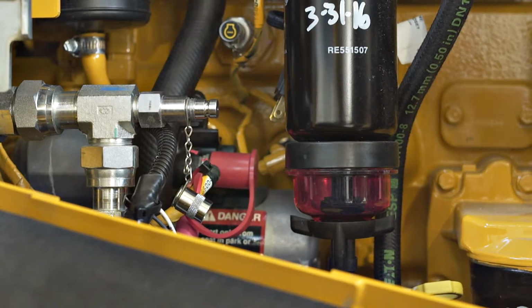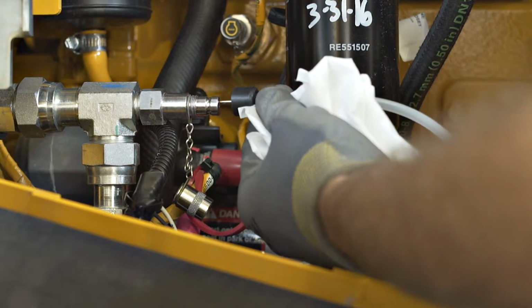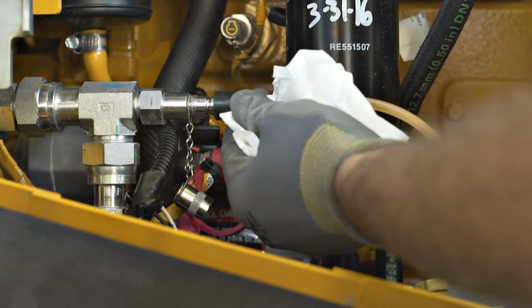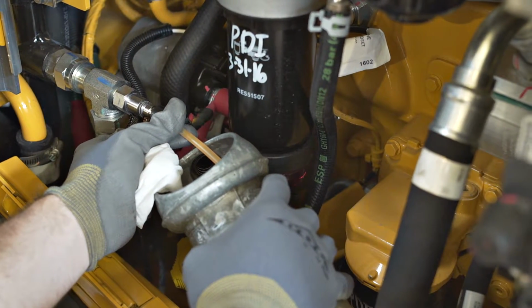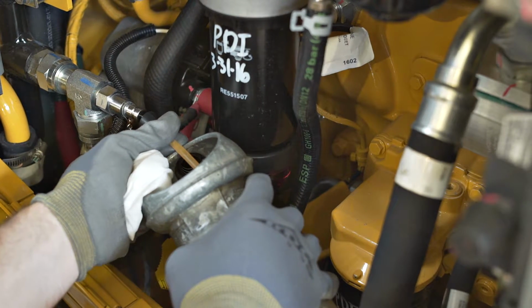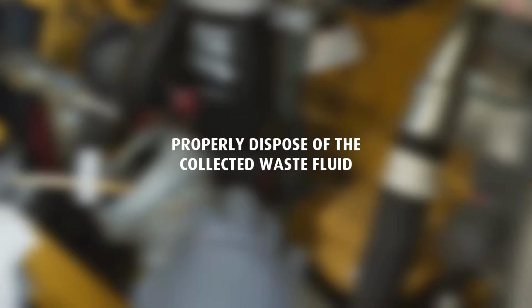Purge oil from the system to ensure a representative sample is collected in a test collection bottle. The appropriate amount of waste oil is determined by the distance of the sampling valve from the flow of the system. It is recommended 1 full sample bottle, equal to 100 milliliters, is purged from a remotely mounted valve prior to collecting the sample. Properly dispose of collected waste fluid.